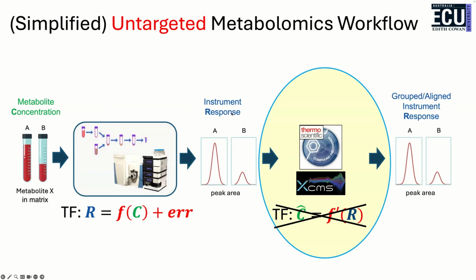And also for a targeted assay, you would go to a lot of effort and time to really tune your instrument and the chromatography to pick up whichever metabolites you're targeting, so that you get very clean, accurate data along with the calibration curve that you're generating. Now, what we do with untargeted is we replace that calibration curve with some deconvolution software, and then the instrument is tuned to cover as much of the metabolome as you can, but it's not targeting particular metabolites. It's very general purpose.